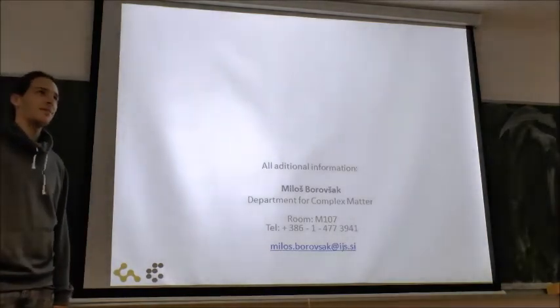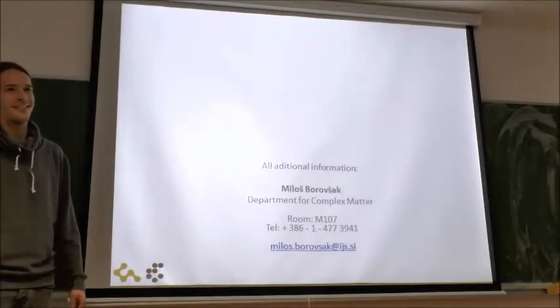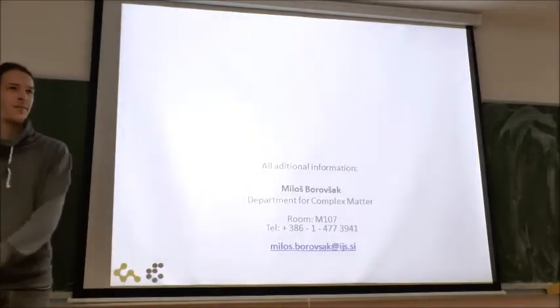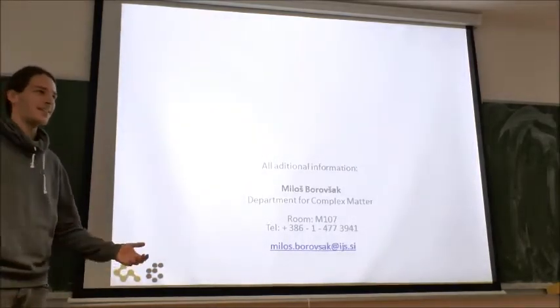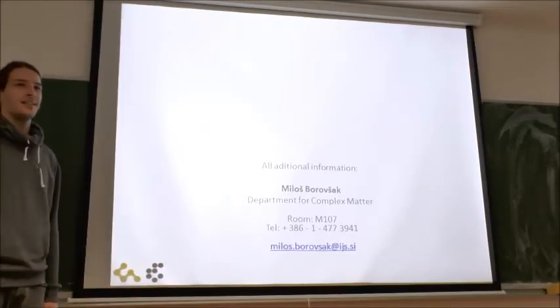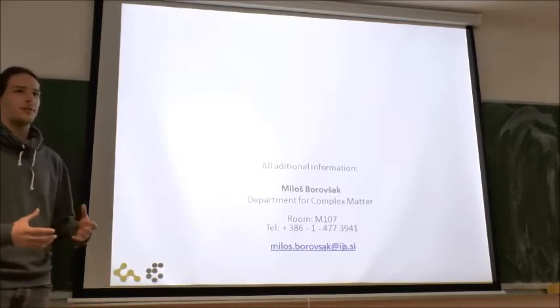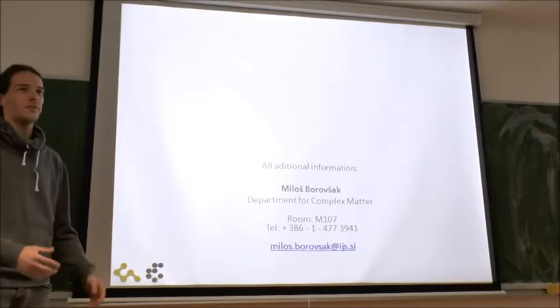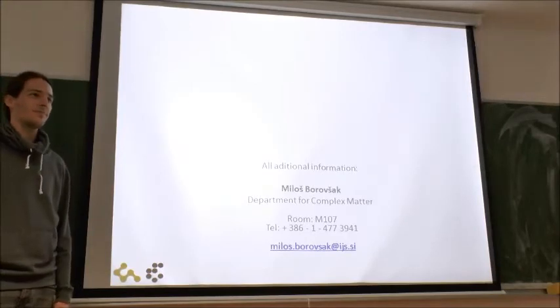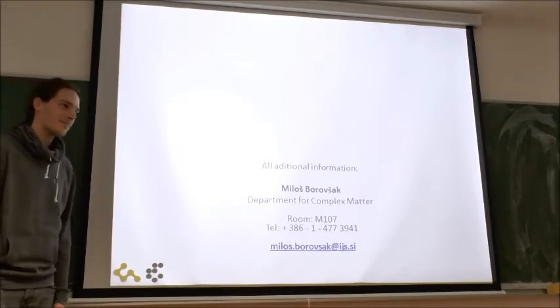Samples in liquid, I don't know exactly if it's possible. Both AFM and Raman can be done separately in liquid, so maybe it's possible to combine these techniques, but I don't know if we have the special head, I mean the chamber for measurement in liquids. Okay. Thanks once more.